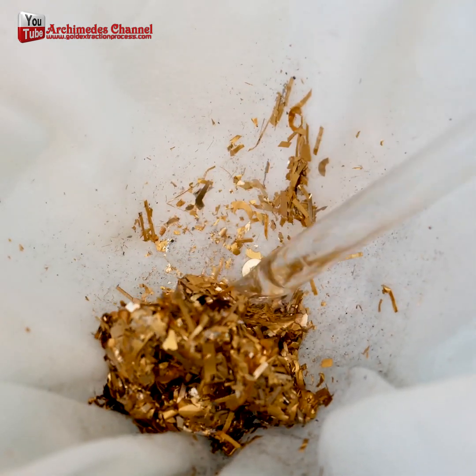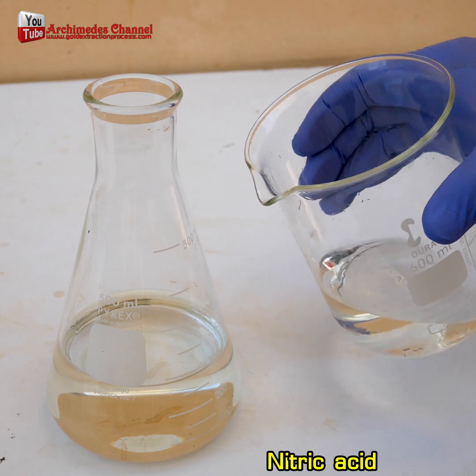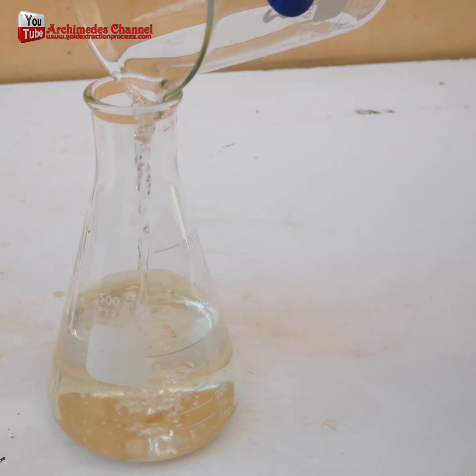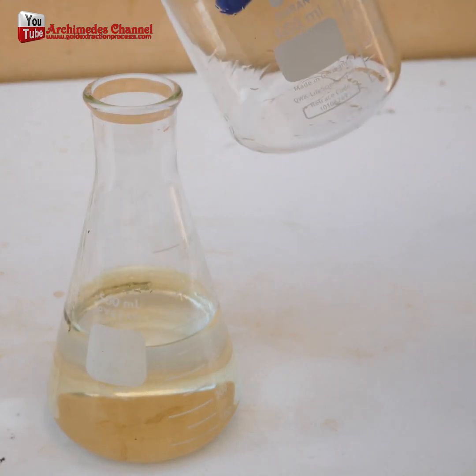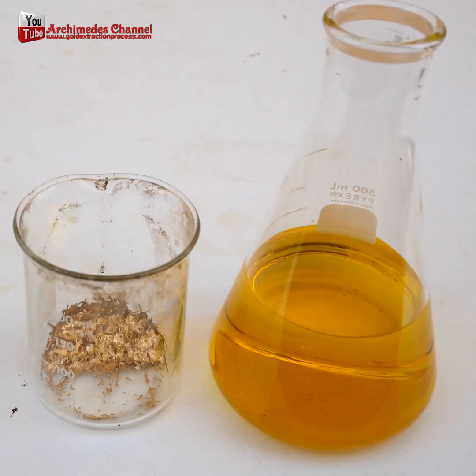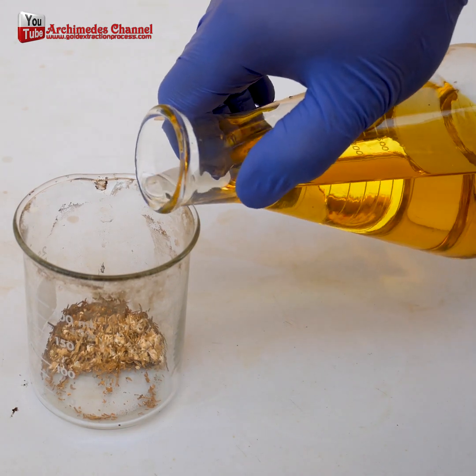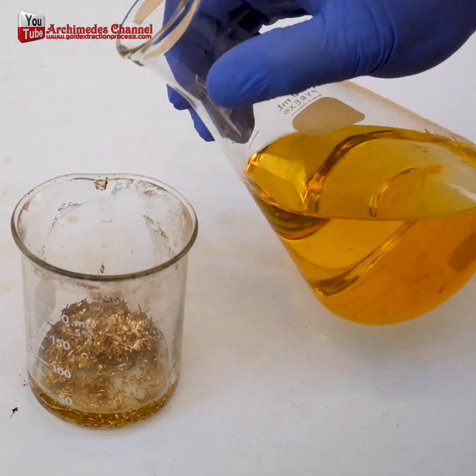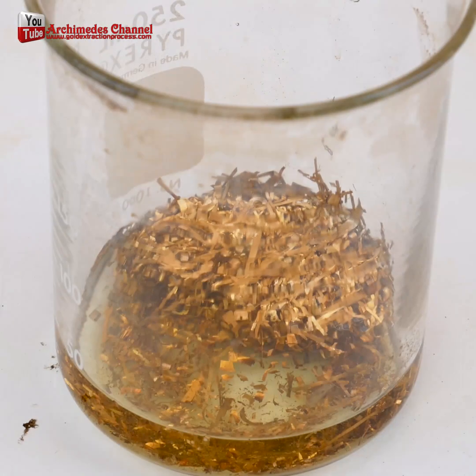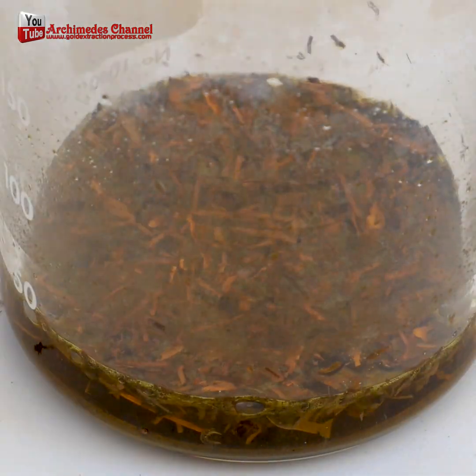Aqua regia solution is usually a yellow to reddish-orange fuming liquid with a rapidly changing composition. The traditional aqua regia solution is comprised of a three-to-one molar mixture of hydrochloric acid and nitric acid respectively. Note that concentrated nitric acid is about 65% and concentrated hydrochloric acid is nearly 35%, so the volume ratio is generally one part concentrated nitric acid to three parts concentrated hydrochloric acid. Participating chemists should wear proper protective lab gear, as aqua regia releases toxic fumes and is very dangerous if it comes in direct contact with human skin.